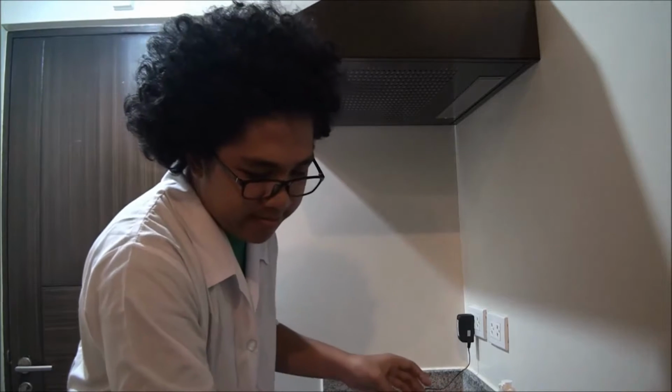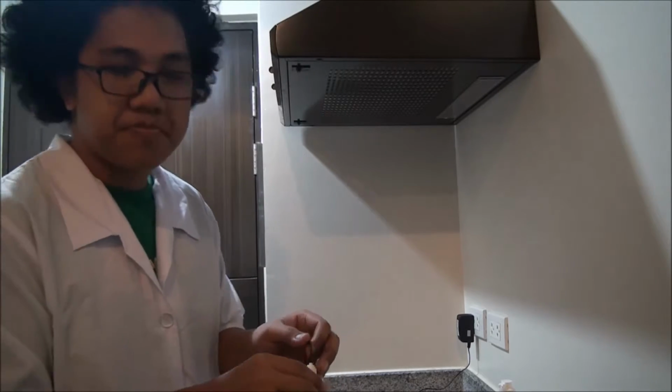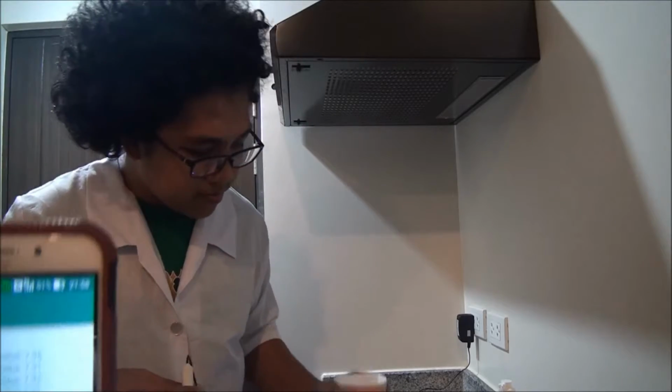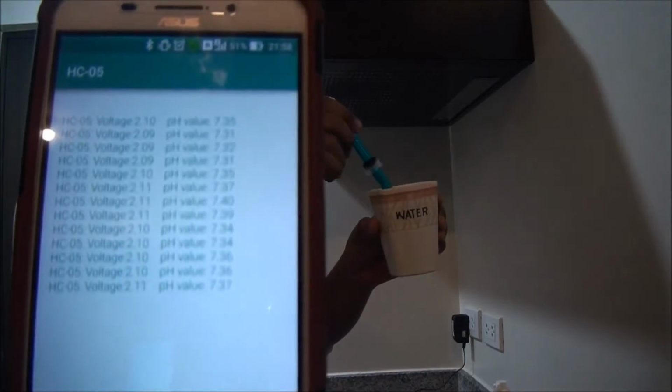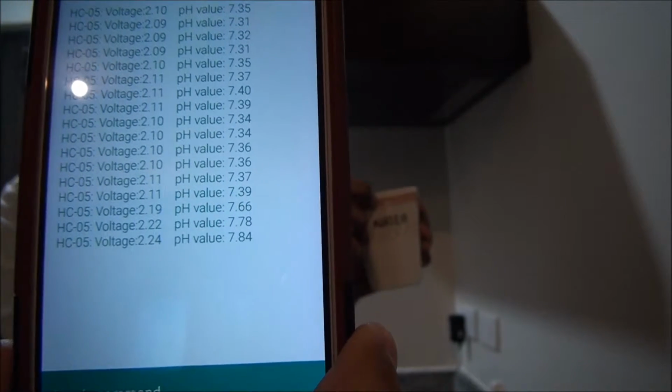So I think we're ready. May I see the reading, please? I actually have Mr. Soralio here assisting me so that he can show you our data. First off is water. So I'm gonna dip it in water and wait for it to stabilize. Mr. Soralio, may I see the data, please?